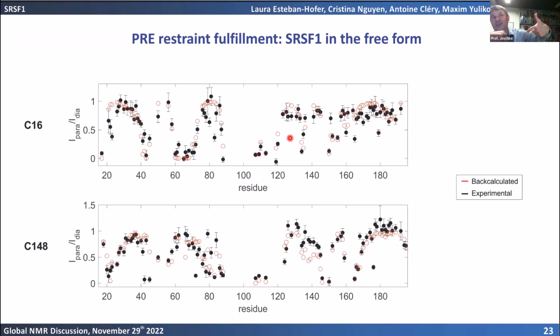This also means we should probably make an error estimate for the distance distribution which involves several analysis procedures, and maybe also an error estimate coming from the models that we put in. So this is really still work in progress, and I would expect that it will take a decade or so before we can really have good error estimates for ensemble structures.